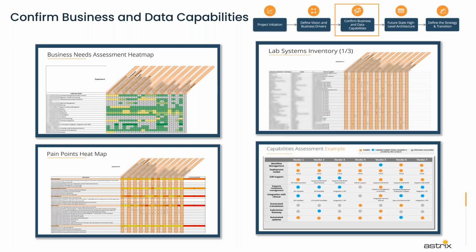So we need to understand what is your lab systems inventory. What are the different ELN systems, what are the LIMS systems, instrument connectors, which we are using for what purpose, like that we define it. And based on this, we do an assessment on the vendors. So we do a capabilities assessment on the vendors. With the multiple applications that we are having, we may be adding something, for example, from the current industry trend, we may need to utilize this vendor, or you may be having a legacy relationship with that company, so we need to include them also in the evaluation phase.